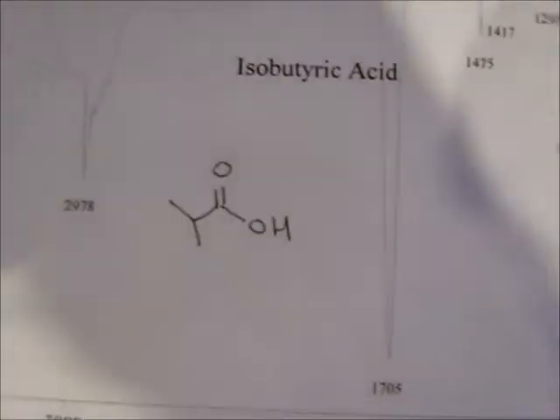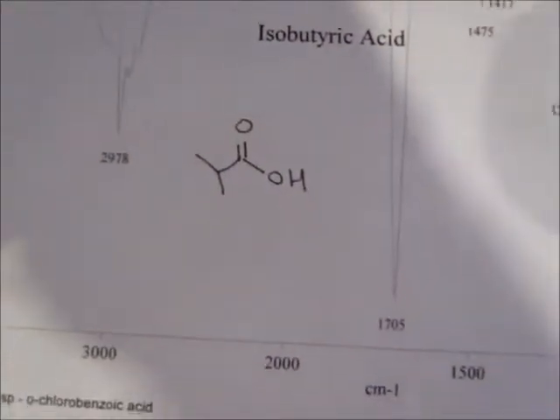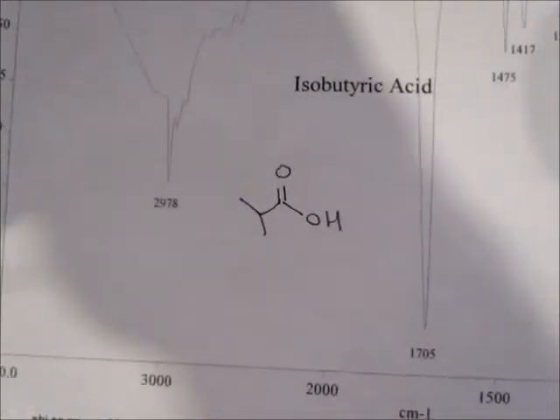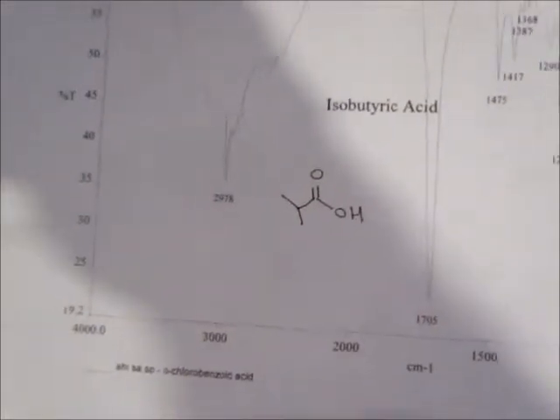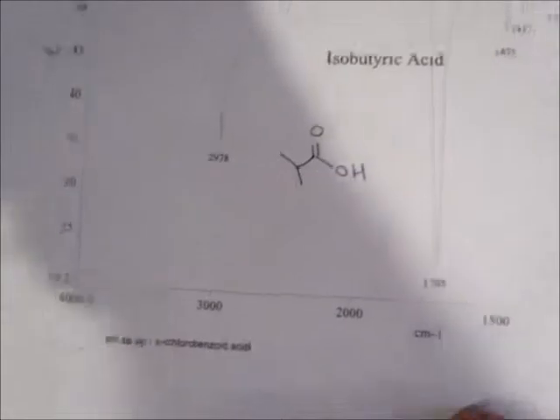So the whole point was, we took the acid, we converted it to the acid chloride. That was one reaction. I think it was called reaction 8. Then we took the acid chloride and converted it to the amide. So there's two reactions in a row. So there was a video that had IR, NMR, and even lab discussion-based things. So what we're going to do is compare.